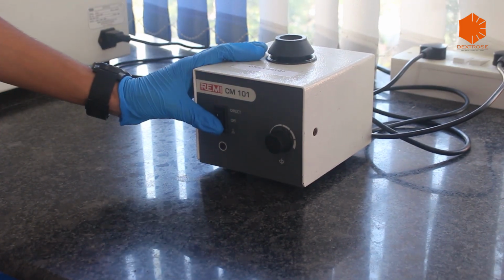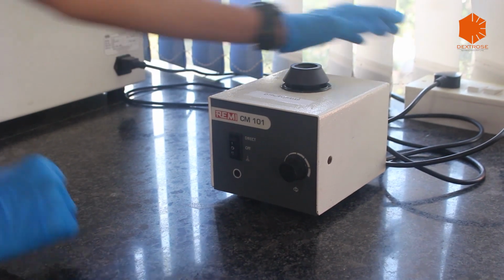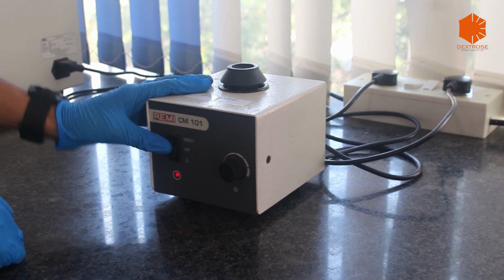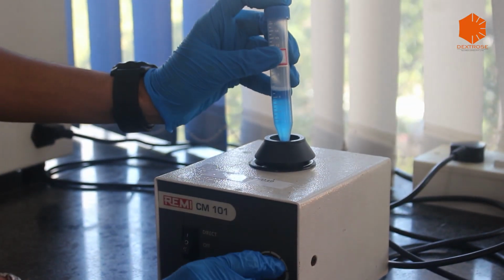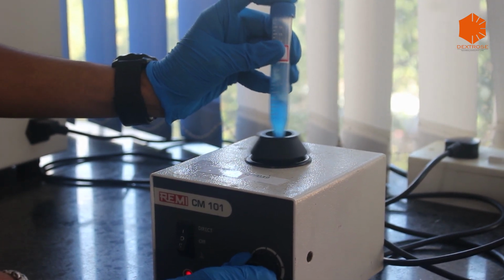So this is the button which we have to keep in direct mode when the sample is placed for proper mixing. Now we should first check the connections. We have to turn on the button and keep it on direct mode. We have to take the sample which is for mixing and adjust the speed. Make sure you do not hold the sample very tightly.